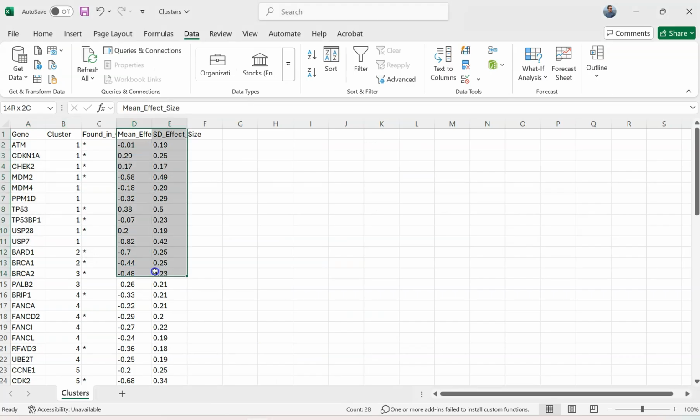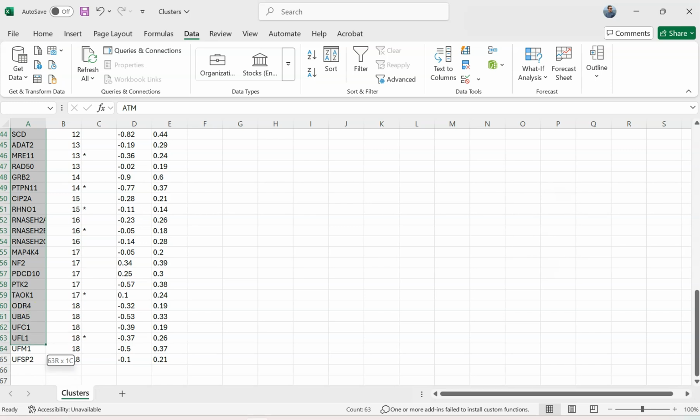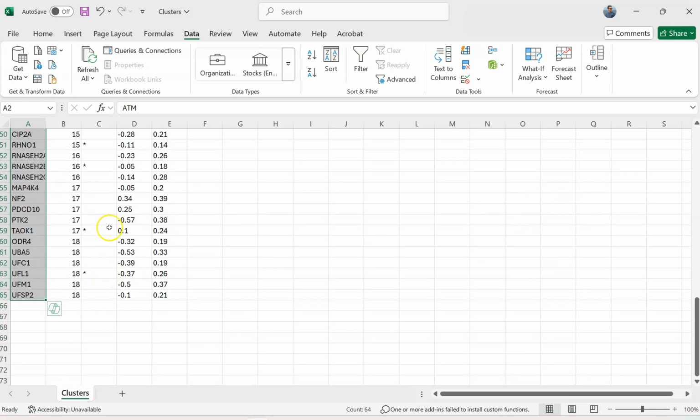So in design mode, if you want to design a custom CRISPR screen target, you started with one list, and now you can copy this whole list and base your screen on those genes.